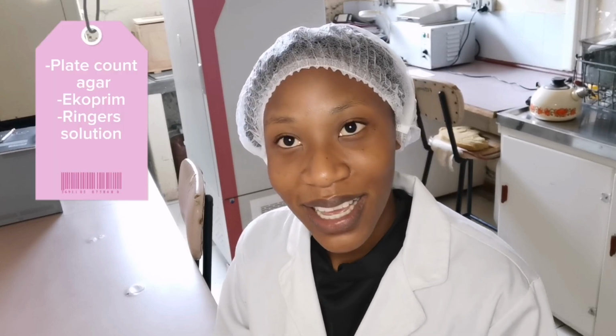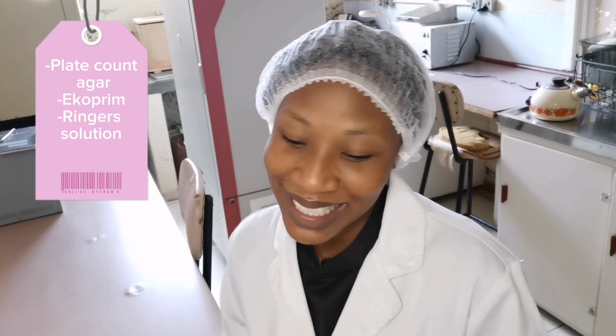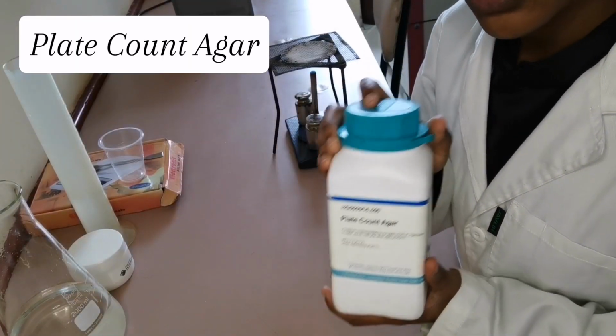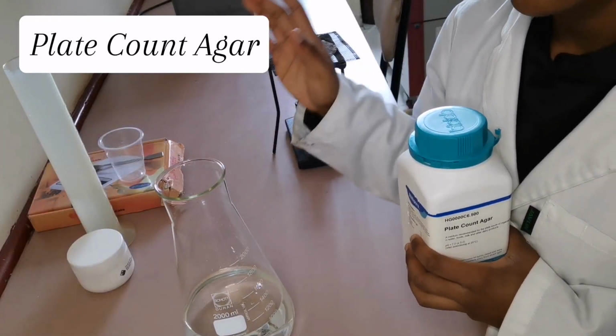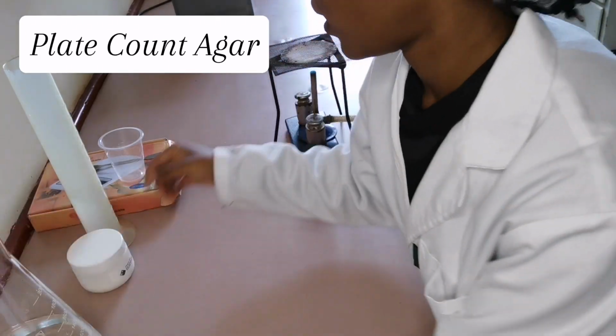Prepare the plate count agar with me today, as well as the Ekoprim and the Ringer solution. Stay tuned. First of all, we're going to dissolve 23 grams of this plate count agar powder into this 1 liter of distilled water.